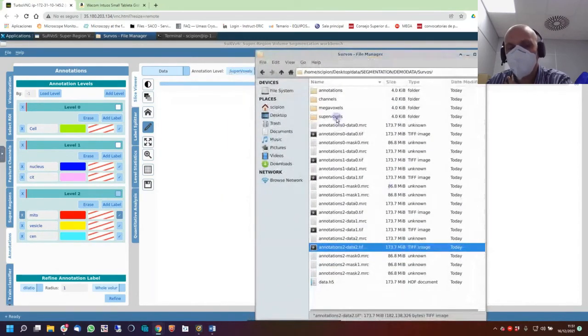Having the annotation like this, if you keep all this information in the same structure, the same position, it will be nice, because it will allow you, in Chimera, to put the colors and everything to one volume and export all this to the whole volumes. I did it at least in the old Chimera. So you create a session, there is a Python file, and in the Python file you can search for names, and all the names will be named like this.